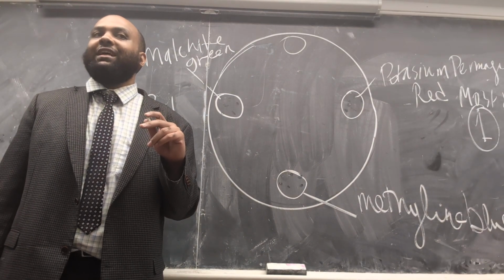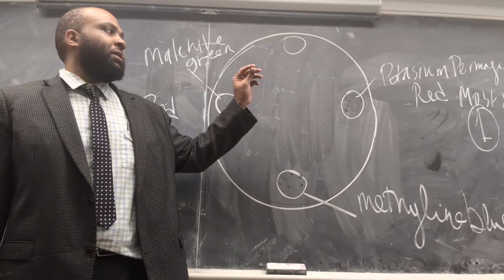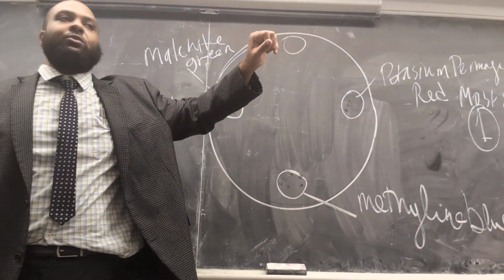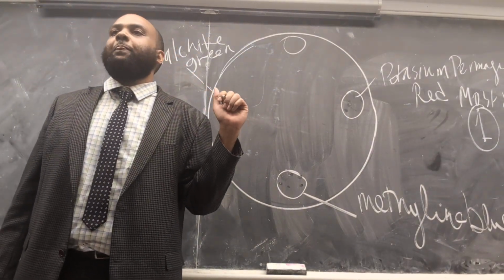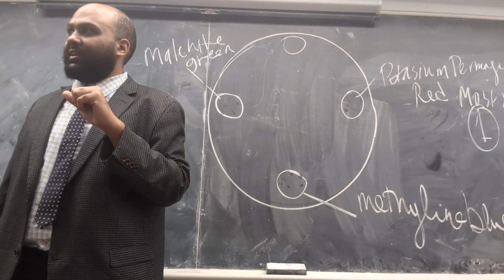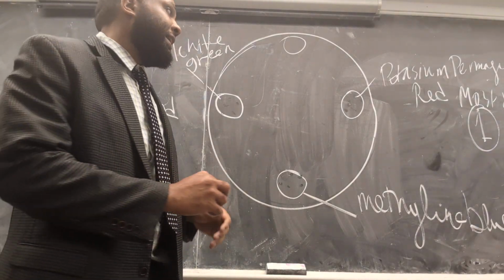So what do you guys expect to see? If you put these solutions in each hole and you leave the petri dish alone for a whole day and come back, what are you gonna see? They're gonna go to the top. They're probably gonna spread around. Yeah, they're gonna spread around. That's the excellent word I'm looking for. So they're gonna start spreading out.